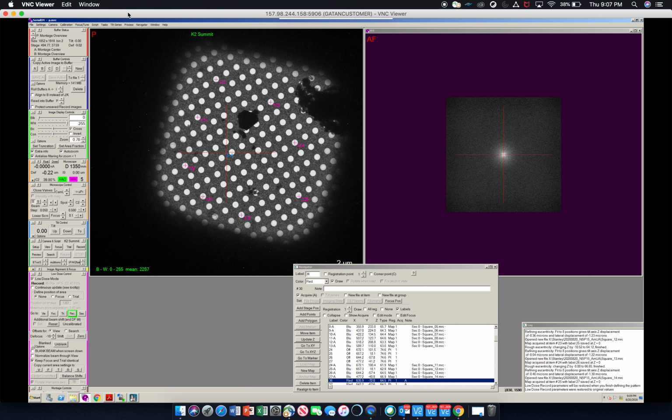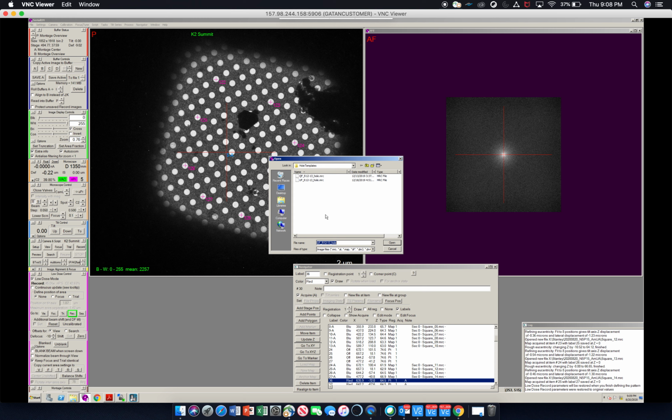And last but not least, this is something you're going to forget a few times once you start doing this without any helpful videos, is loading an image into Buffer P. So you're going to close out the current window, and you're going to read the image that you have saved.